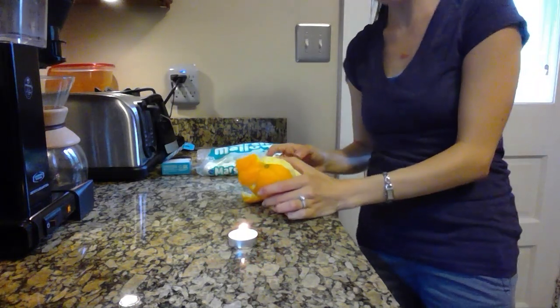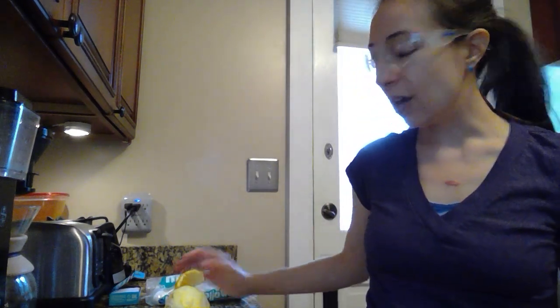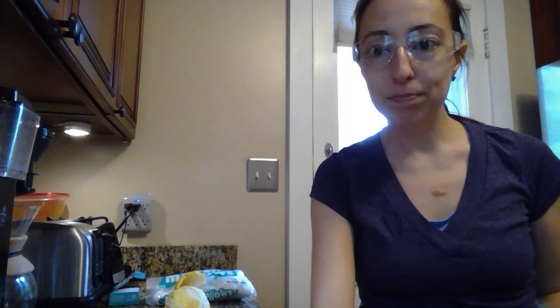All right, so that's the method you're going to be using. You're going to be taking your orange, holding it over your flame, and seeing what exactly happens. Okay? And again, you can try it with a couple different peels, try it a few different times. You then have a box in part D for your observations. So write down what you saw. Maybe you saw something happening with your peel. Maybe you saw something happening with your flame. Make sure to record all of that.